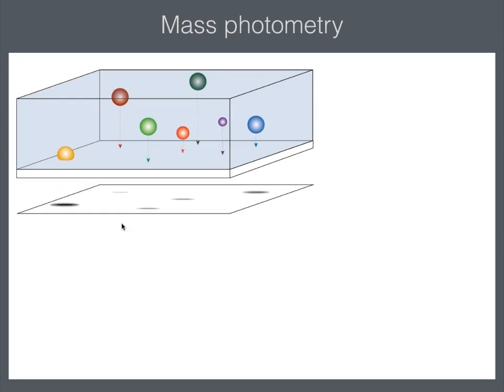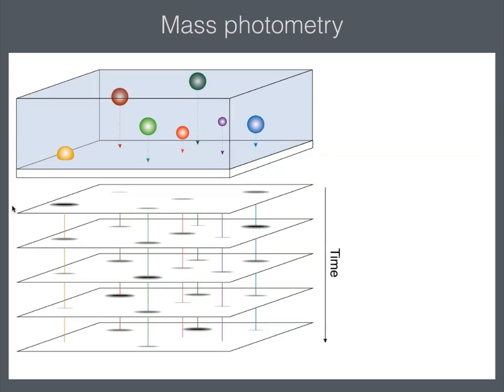Well, schematically, we take an image on our detector, on the camera within the instrument, and the molecule that was near the surface, basically touching the surface, gave a significant amount of signal, right? So this is our interferometric contrast. Then rather than just recording one image, we record a movie. So we get multiple video frames, and we look for differences that have occurred between the frames and the preceding frames.